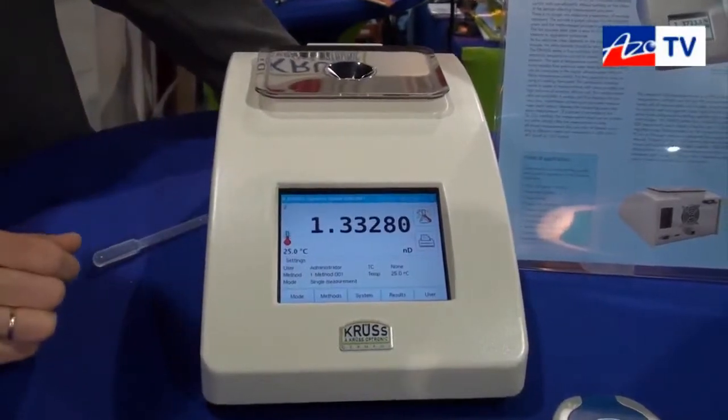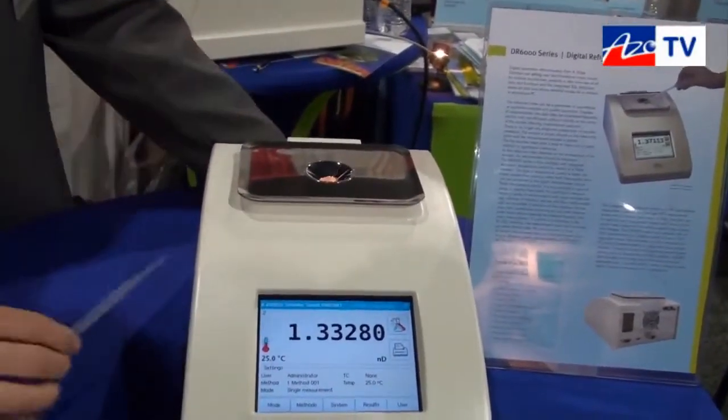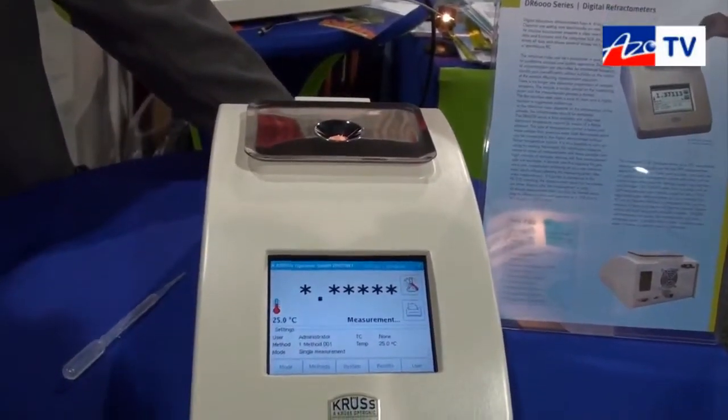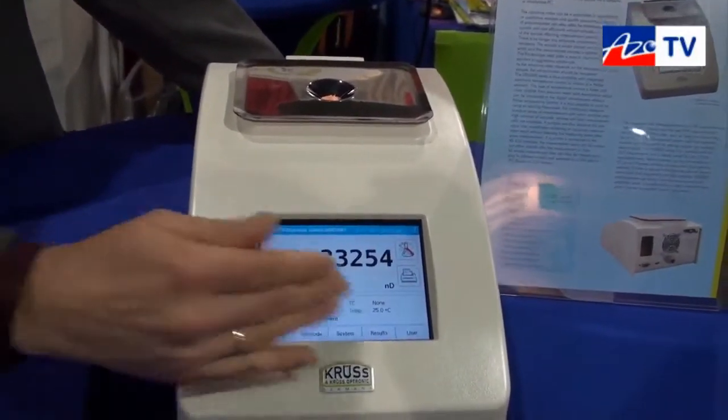Measurement is very easy to use. You need only a sample — just a drop here — push the button and the measurement will start automatically. All the settings you do on the touchscreen.